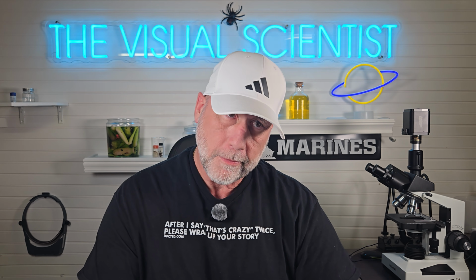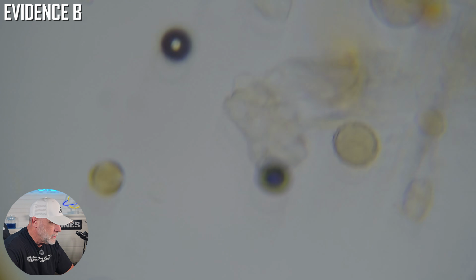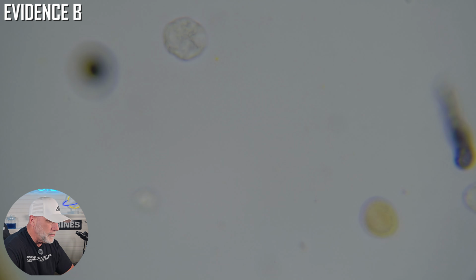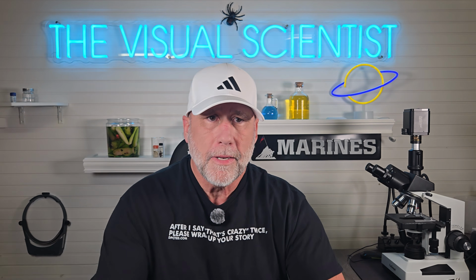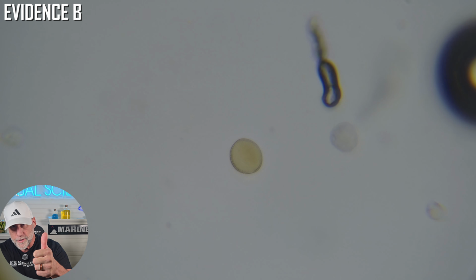Guys, are you seeing this? This is almost completely empty. I don't know how else to describe it, but evidence A had structure. This is almost none. It looks like a completely different substance. I need to go to 1,000 times. You ready for it? The molecular front line.